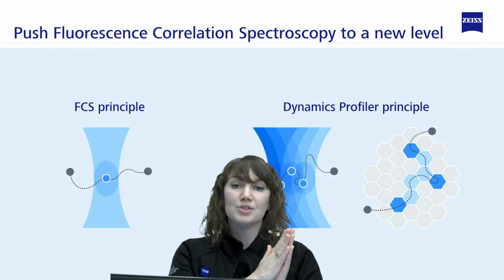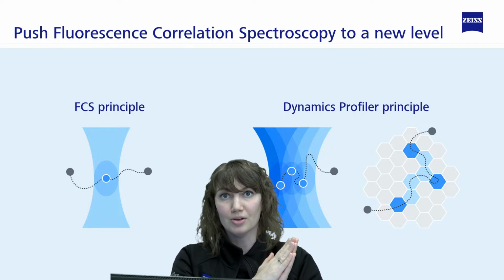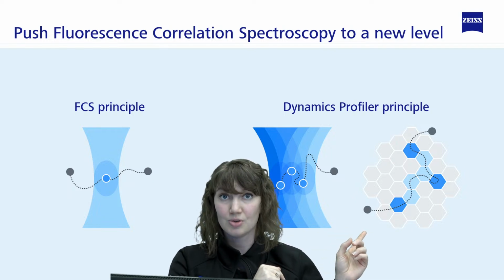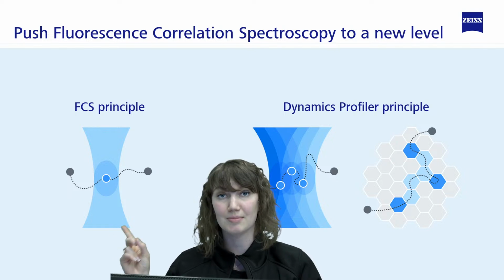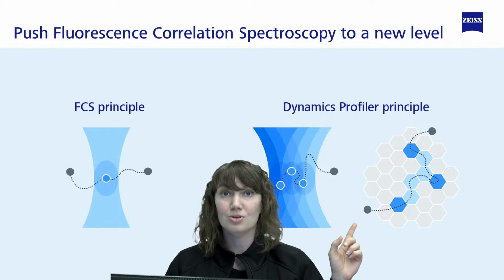detector. So I won't dive too into the weeds on the Airyscan detector today. We have a lot of great material if you want to learn more about that. But what it is, it's a 32-channel array detector. So rather than relying on one spot and getting measurements out of one spot, you're now multiplying that and getting data out of this 32-channel detector.